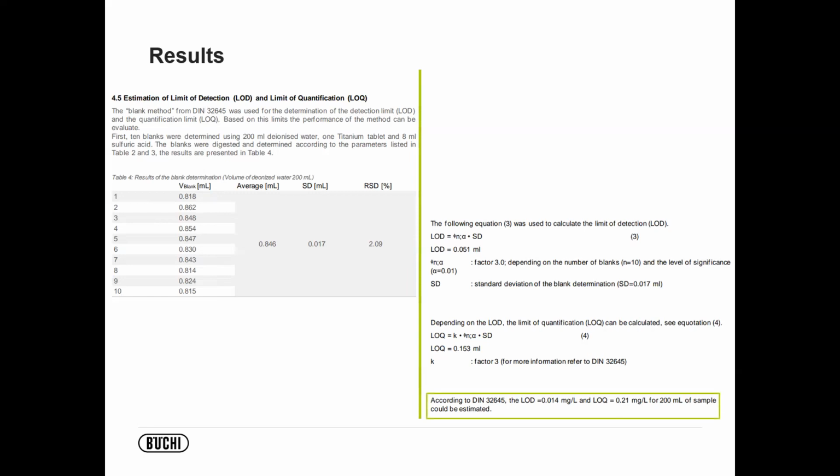So the really nice thing about Kjeldahl and this really traditional form of chemistry is that we're able to achieve very, very high limits of detection. So if you're using a more manual method, or like I say, you're using dye kits or hach kits or something like that, your reliability, dependability, and also your limits of detection are probably not going to be as great. So this gives you a lot more trust, but it also allows you to catch a lot more TKN if you're running extremely low quantities, parts per billion and things like that.